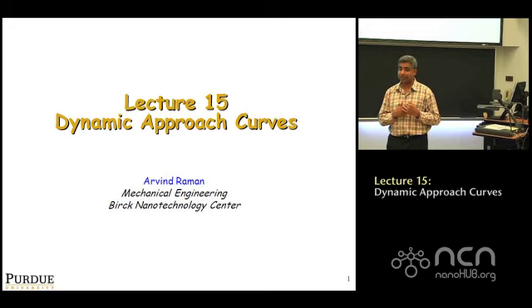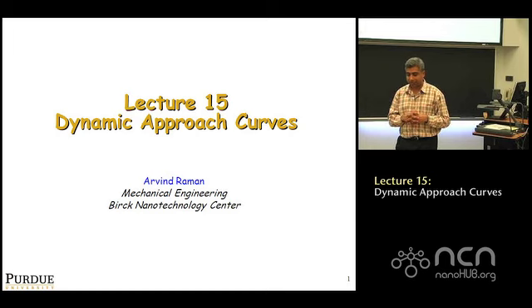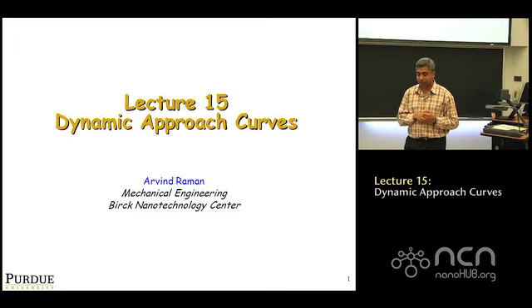We covered last week the basics of the point mass oscillator model for an AFM. We made the distinction between free oscillations, which in the vibrations terminology refers to when you just take the cantilever and ping it and let it die out. That's what free refers to. And then we talked about forced vibrations, when you actually drive it with some excitation. What's the response of these two things? There's a distinction to be made between the two.